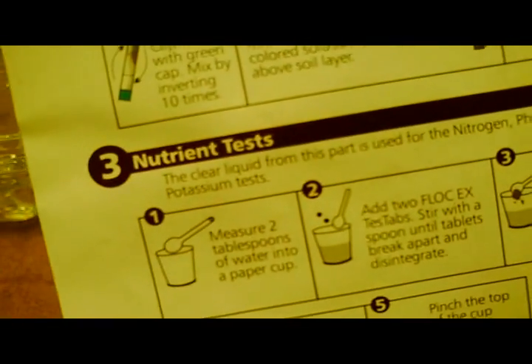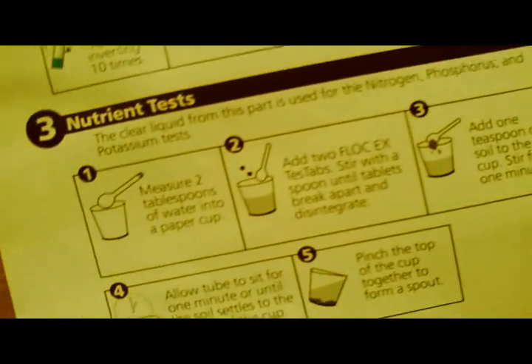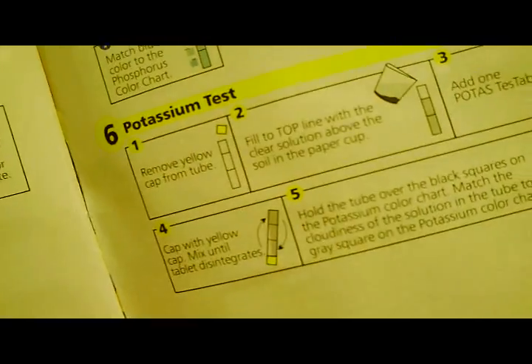For the next part of the test — the nutrient test for nitrogen, phosphorus, and potassium — we have to create a slurry out of some kind of tablet and water, then mix in the soil, let it settle, and pour the water into the tubes with another tablet to get the results.